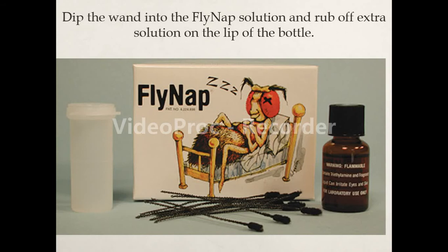So take a little stick, a wand, that is used to enter the culture box, and take a small dip into the FlyNap solution. Rub off the wand and remove extra chemical from the end of the wand, and insert it into the culture box which contains the Drosophila flies. First, dip this wand that contains the chemical traces, and place it on those culture vessels that contain the Drosophila.